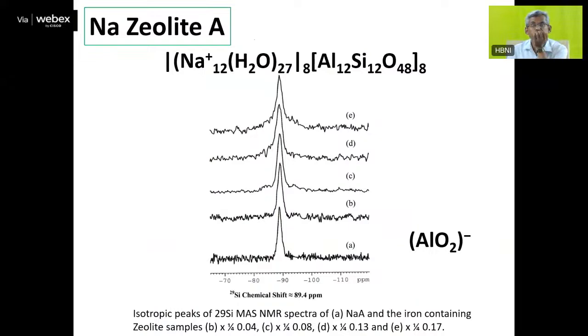I thought I will show you one spectrum which we have recorded using the NMR spectrometer. This is a typical, representative compound, zeolite A. It does not have much application; it is only for basic studies. People take this material and record NMR. It is a very interesting structure. The number of aluminium and silicon are the same, so the silicon to aluminium ratio is 1. It is a model compound. The structure is well established, even by single crystal XRD.